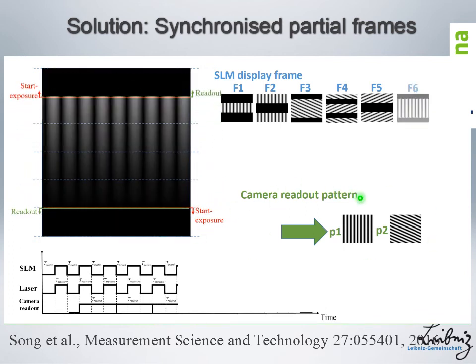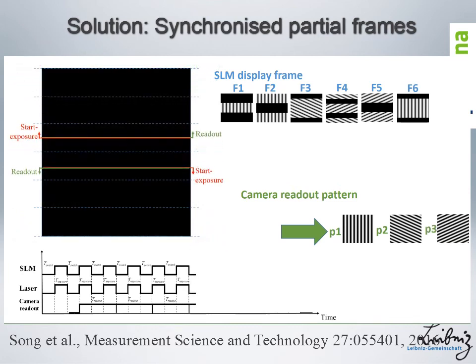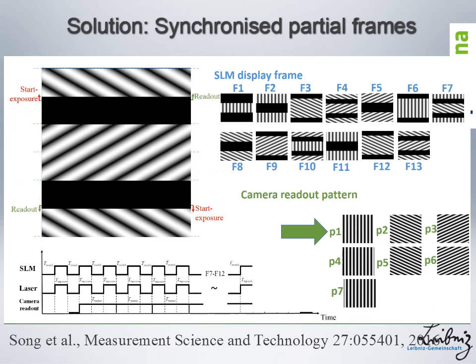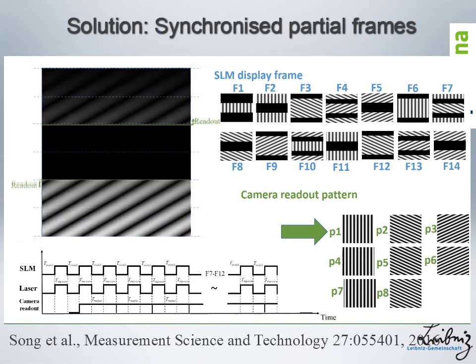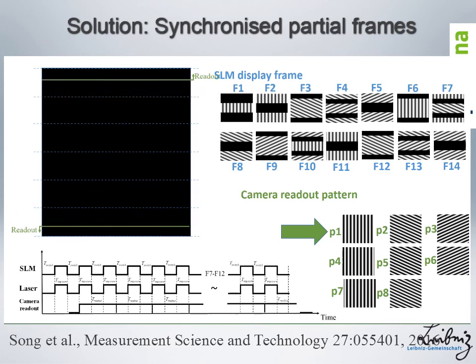So it is as if you had acquired fully normal images, but you're losing only 1/3 of the exposure time. This way we are able to get all the structured illumination images really fast. You can see the publication here. So now all the 9 images have been acquired.